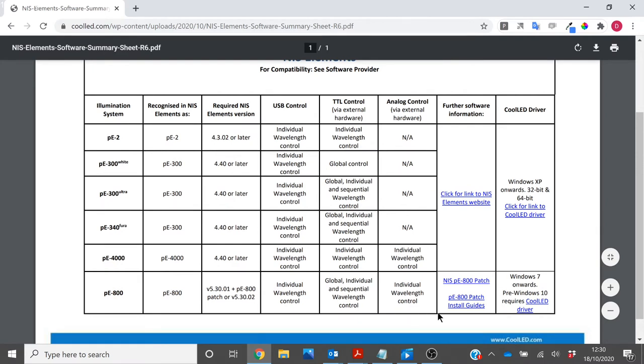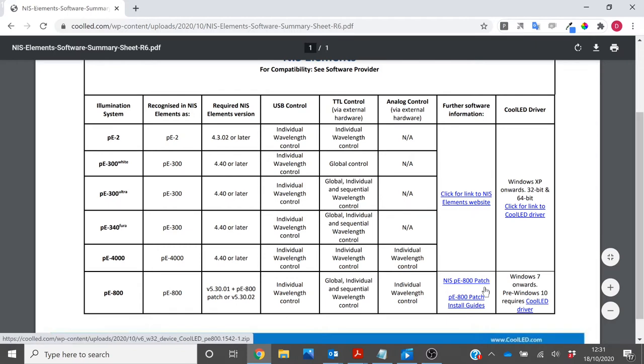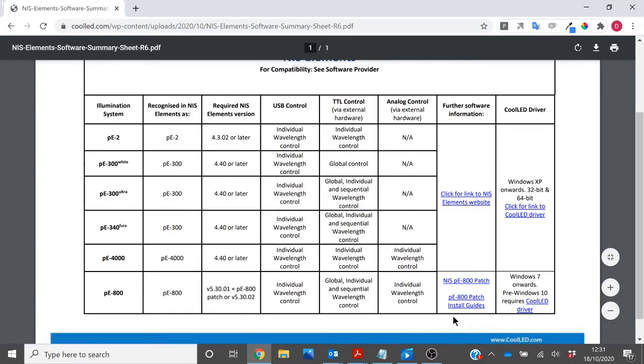Under PE800 you will be able to download the patch file itself and the patch installation guides if you require additional help.